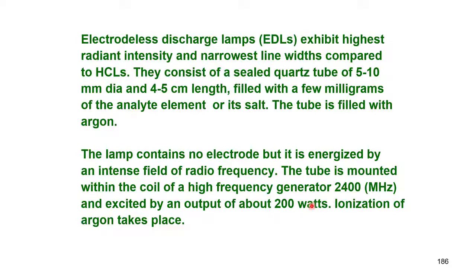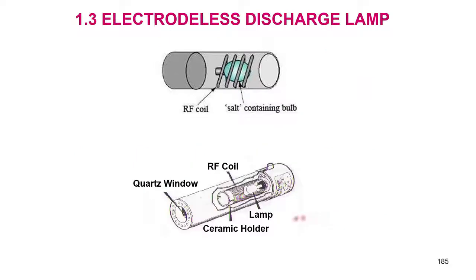This point you should remember, and also you should remember that the design of this can vary from instrument to instrument. In fact, most of the instrument manufacturers change the design, this length, width and then diameter and then connectors like that to suit their models, so that they are also not applicable to other instruments.